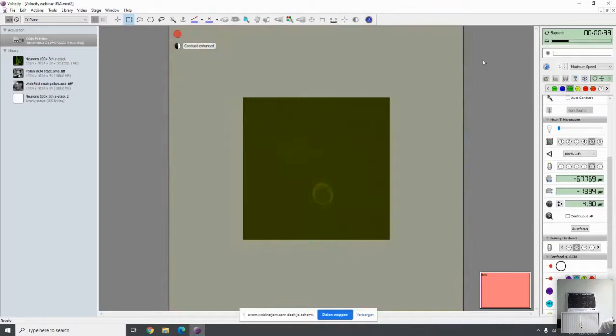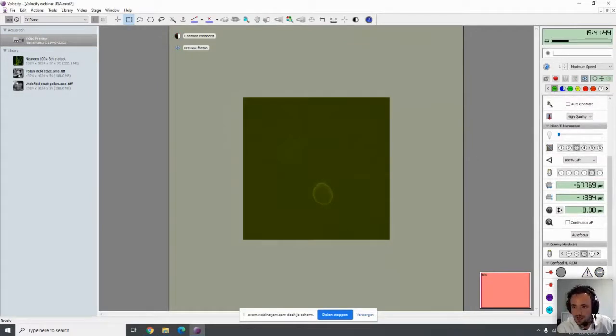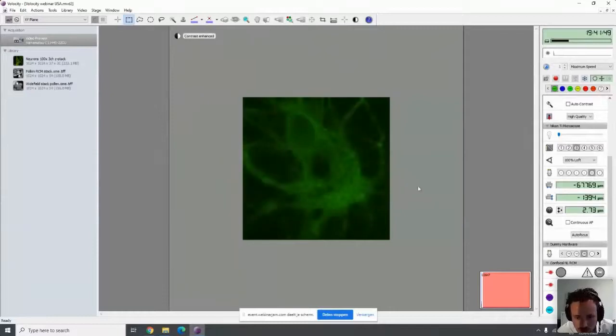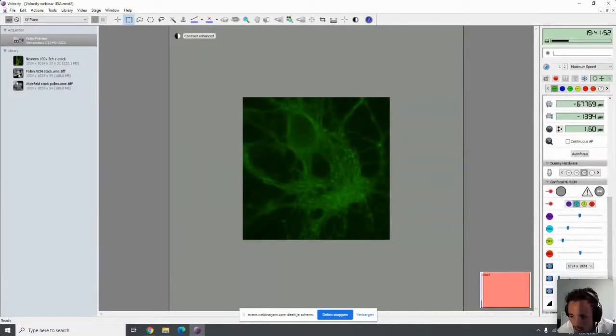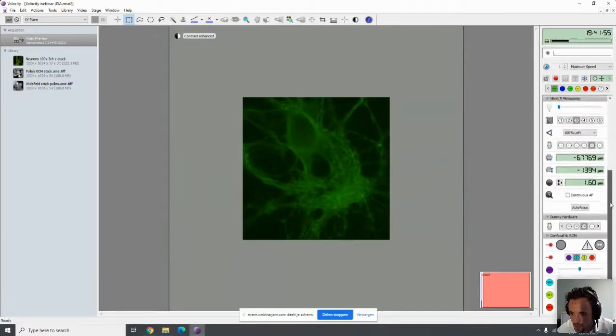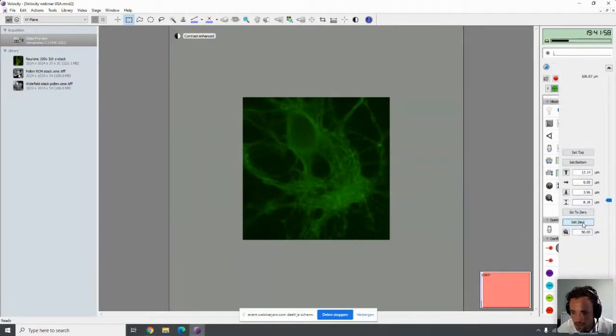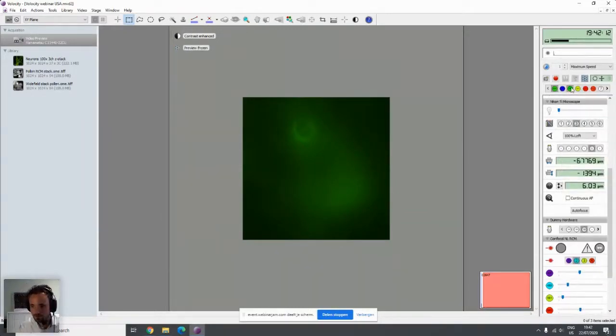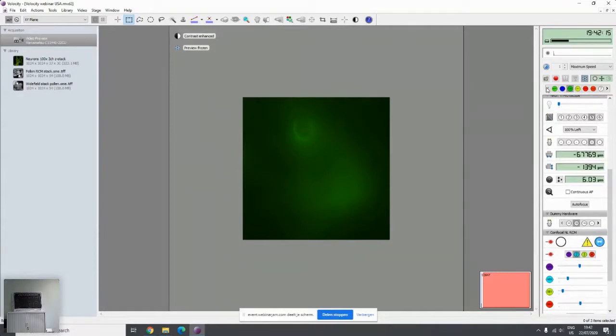So I stop the experiment and I switch back into the bypass mode to adjust my Z stack. Let me see. Here we go. Yeah, so it started out of focus a little bit. I want to be in this mode here. I could say set 0. And we want to start here. And then I move up to here. Okay, so again, 8 micrometer. That makes sense. Move back into the RCM mode and run the experiment protocol.